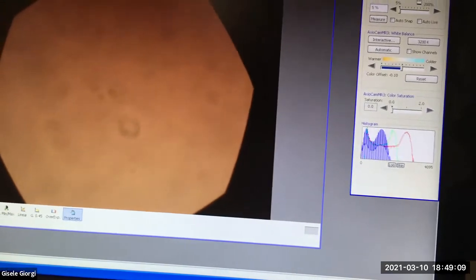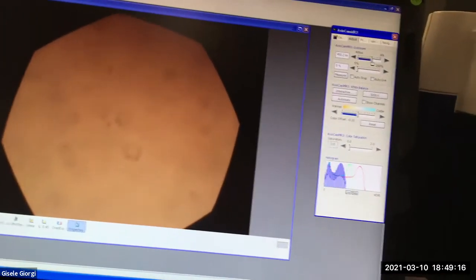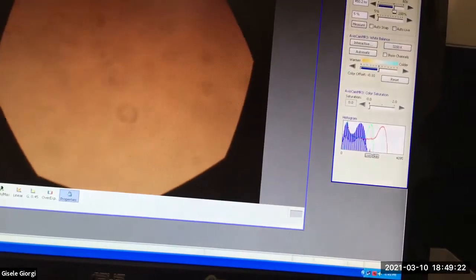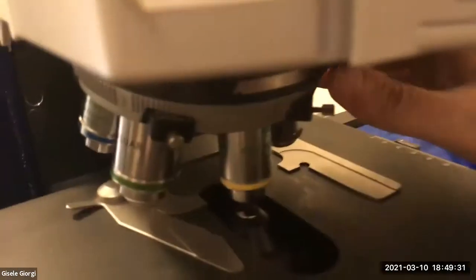And I can also see that it's not quite centered. It needs to scooch up a little bit. I can sort of see it better. I think I knew that from before, but I can see it a little bit better. Hard to do with one hand. That's almost a little bit better in center. Okay, so we made it better with the next power.